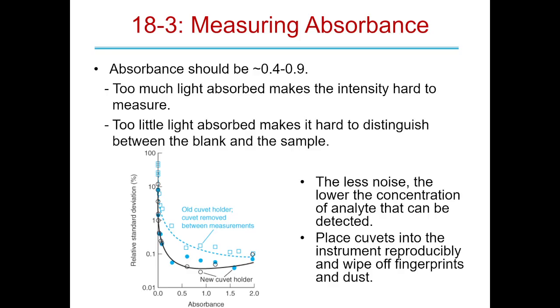Typically labs don't do that, though. What they do is buy match sets, and the manufacturer has done that and given you the tolerances. I don't know if those are match sets sold with that spectrometer, because no tolerances are there. Typically, they'd be on a little slip in the box, and that would tell you the tolerances.